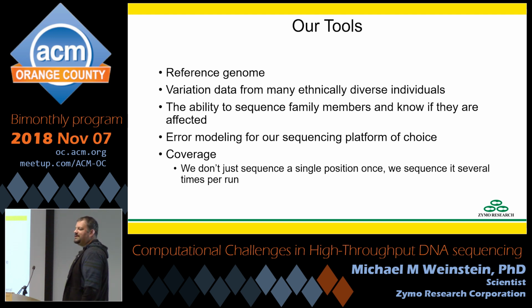Once you start reading about 10 times or more per site, and especially once you start getting up to 20, just about every site you'll have sampling from both copies, both mom and dad's, and you'll have enough that if the sequencer made an error, you'll have a good idea that that might just be a sequencer error.